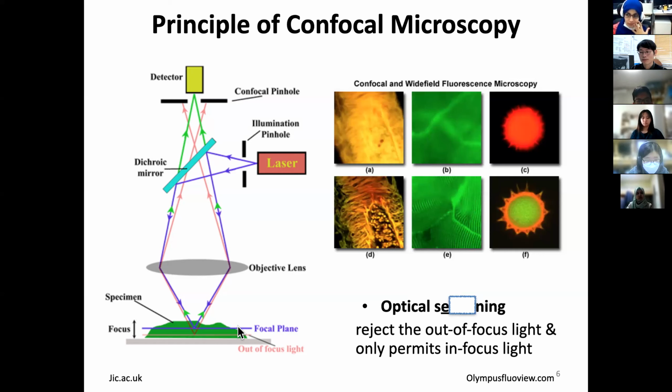Then you have a focal plane over here. And then with this geometry, your fluorescence comes back the same way. So I put a green arrow coming back, exactly the same path, and then it'll focus. You just have to put your detector on here.